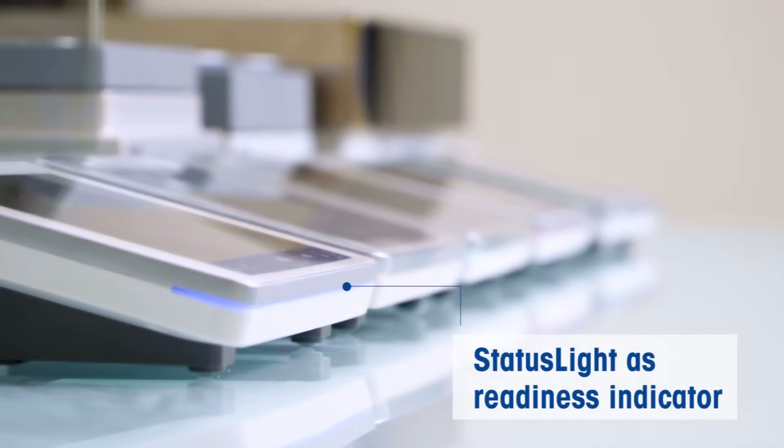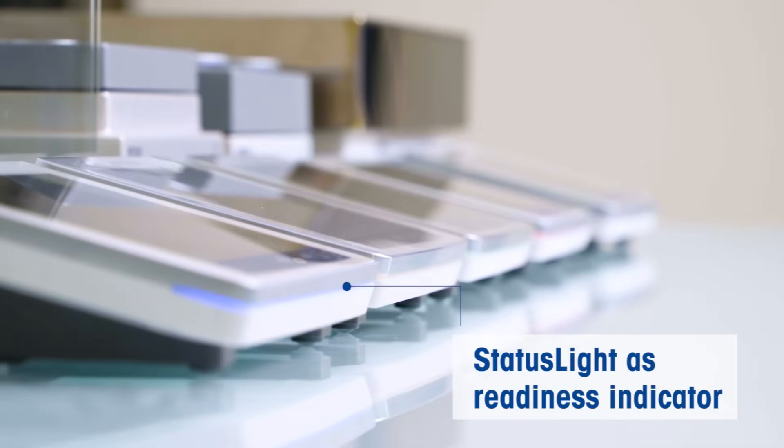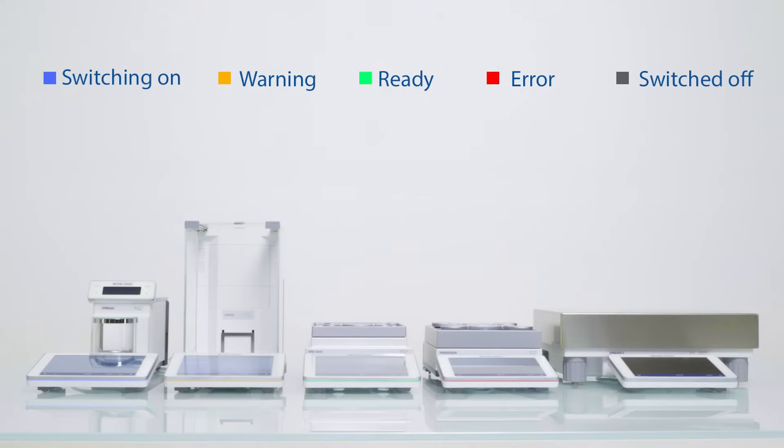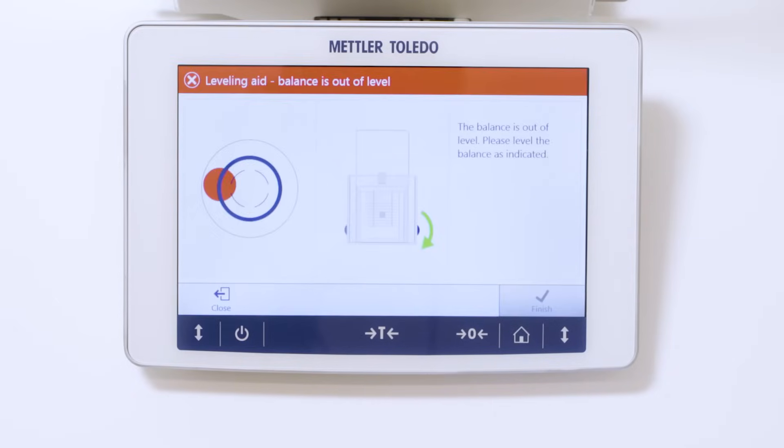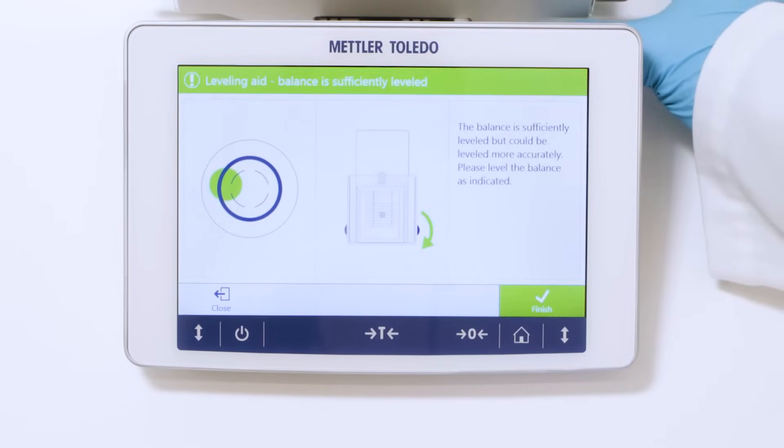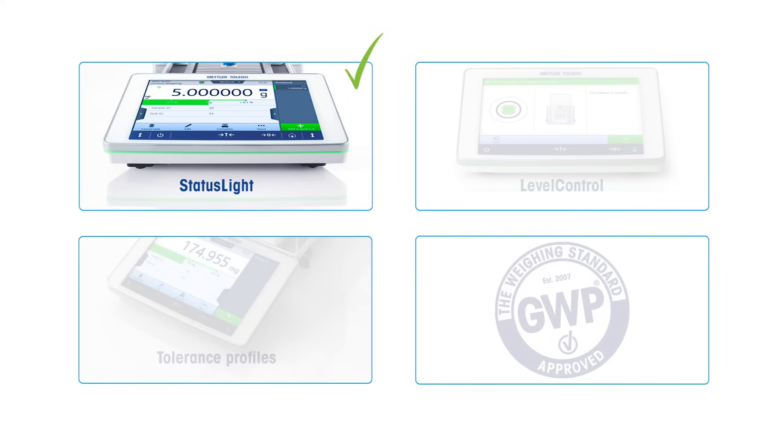XPR balances include four built-in quality assurance features that help to make your process audit-proof. The first is the color status light that shows if your balance is ready at one glance. Next, level control will warn you if the balance is not leveled. Thanks to the graphical guide, leveling is a matter of seconds.